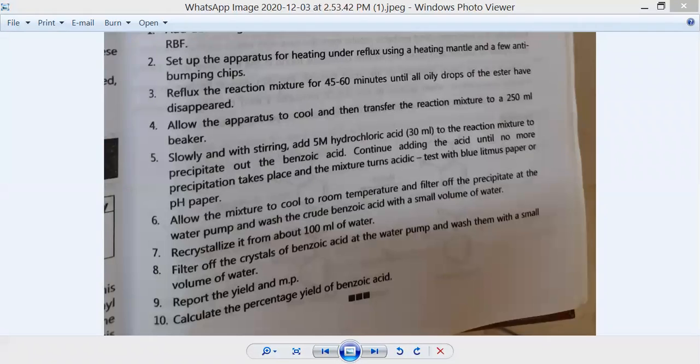फॉर एक्झाम्पल मॉलिक्युलर वेट ऑफ बेंझोइल क्लोराइड 100 आहे. Example I am doing. And the molecular weight of benzoic acid is suppose 110, 110 म्हणजे 100 आणि 110. म्हणजे 100 ग्रॅम ऑफ बेंझोइक क्लोराइड 110 ग्रॅम ऑफ बेंझोइक ऍसिड देतोय थिओरिटिकली म्हणजे रिएक्शन मध्ये. तर मी जर सिंथेसिस करत असताना 5 ग्रॅम बेंझोइक क्लोराइड घेतलं तर किती अमाऊंटचं बेंझोइक ऍसिड सिंथेसाइज होईल थिओरिटिकली हे कॅल्क्युलेट करतोय. ते जे कॅल्क्युलेशनचा यील्ड येईल ते म्हणजे तुमचं थिओरिटिकल येईल आणि आफ्टर सिंथेसिस जे काय तुमचं यील्ड येईल ते तुमचं प्रॅक्टिकल येईल.